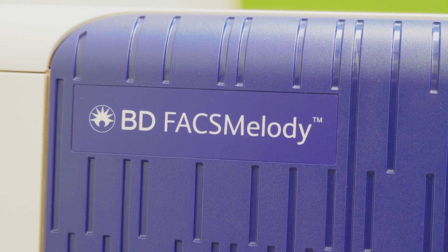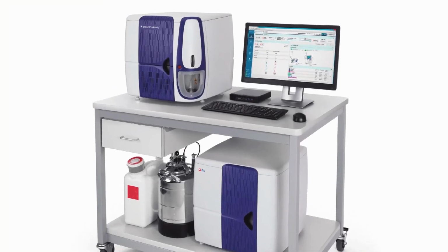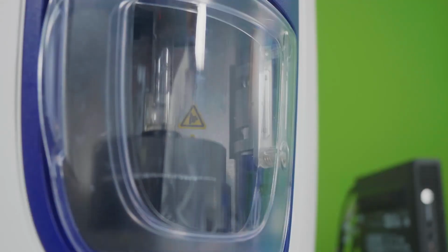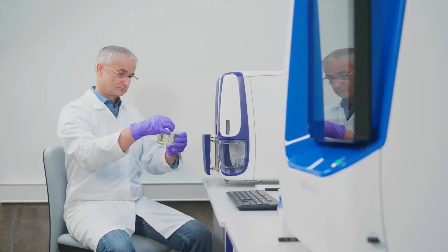The BD FACSMelody is designed to make cell sorting simpler. It offers high-end sorting in an easy-to-use package for researchers. This video shows the ease of operation and convenience offered by the FACSMelody cell sorter.